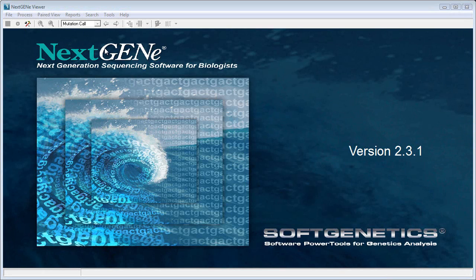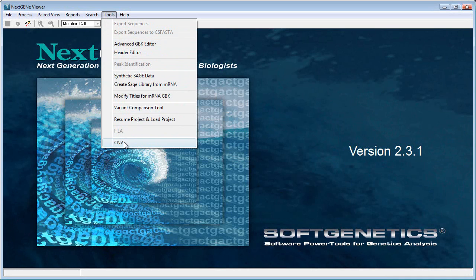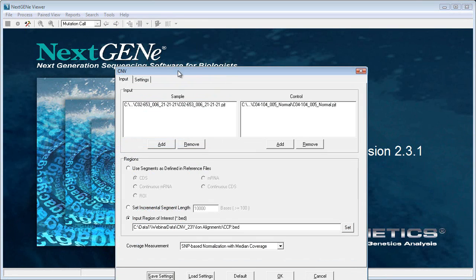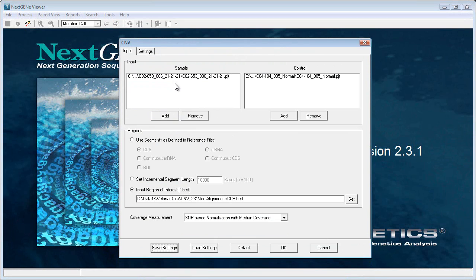In this analysis, I have four different samples, each with two or three replicates, and I also have a normal control sample. I'm going to open the CNV tool from the NexGene Viewer Tools menu. I'm going to load my sample replicates one at a time and compare against that control. Each AmpliSeq file here is actually a NexGene alignment project that has already been run, and I ran all of them with the same settings.